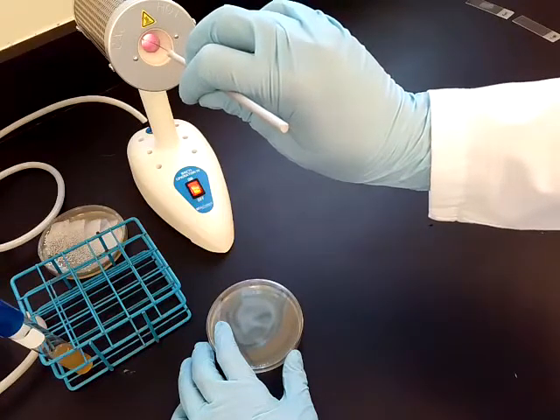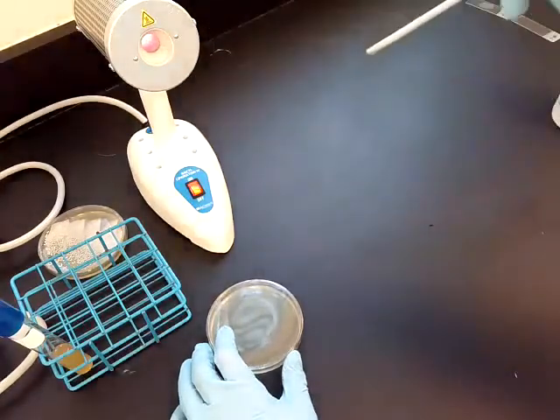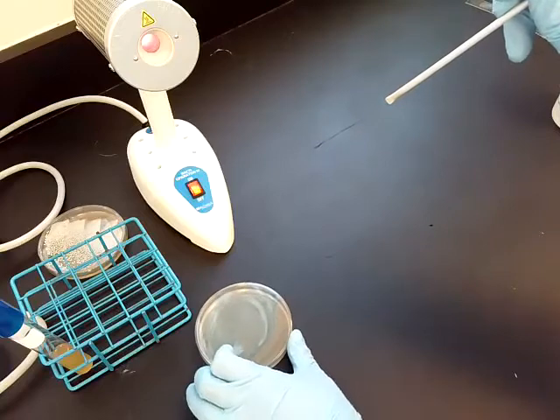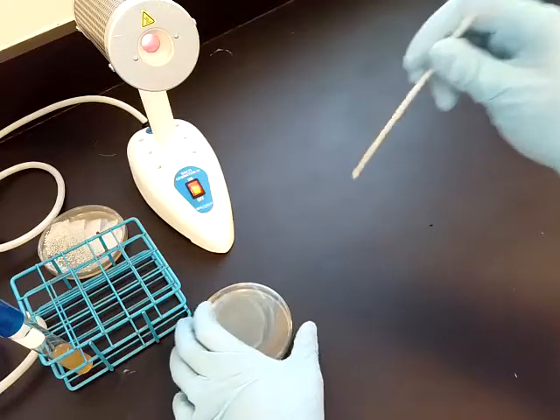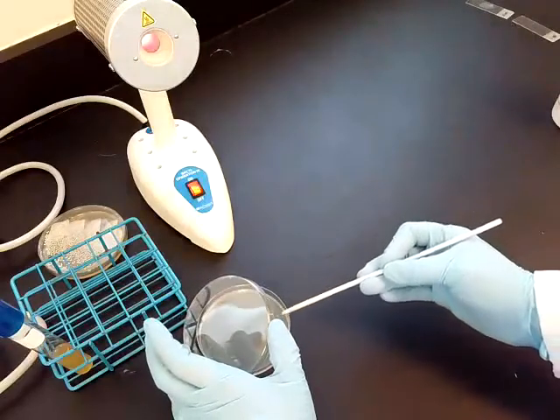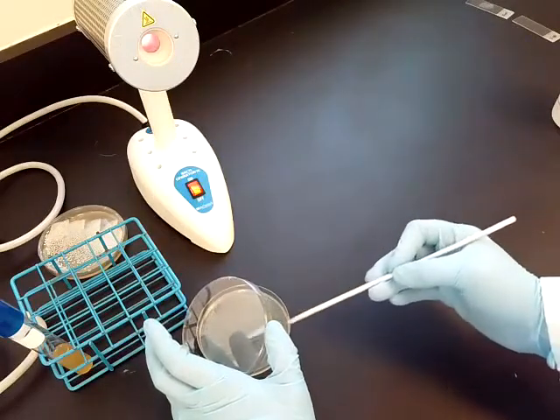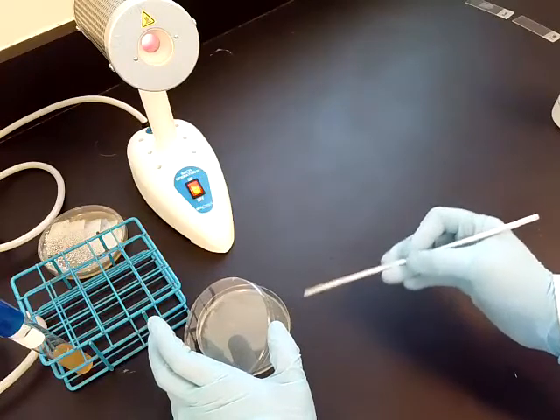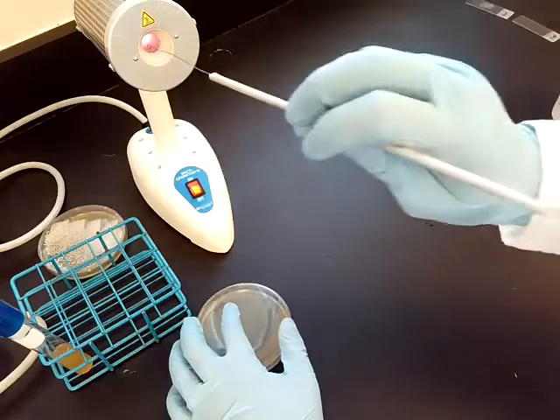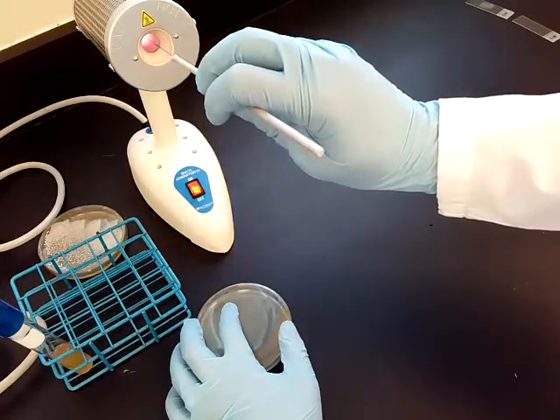Now the goal of this is to take the bacteria that's on the plate and spread it thinner and thinner and thinner until you get those isolated colonies. So I'm going to rotate the plate 90 degrees, and then I'm going to smear from the first segment into the second segment. And I'm going to grab it about 3 times and smear it around in that new segment of the plate. And I'm going to flame sterilize the loop again.